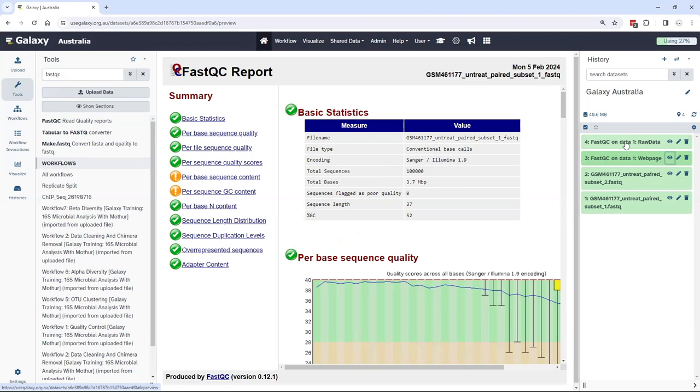And speaking of downstream tools, one of the real powers of Galaxy comes when you can chain multiple tools together. So instead of running one at a time, you're going to build a workflow, chain many tools together, and execute that workflow once on one or many tools.